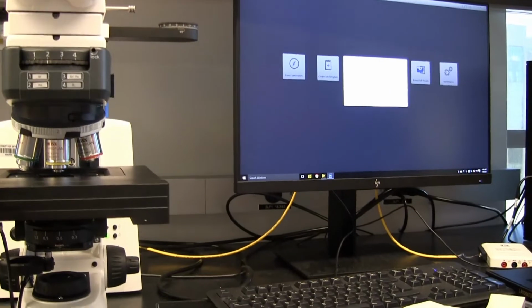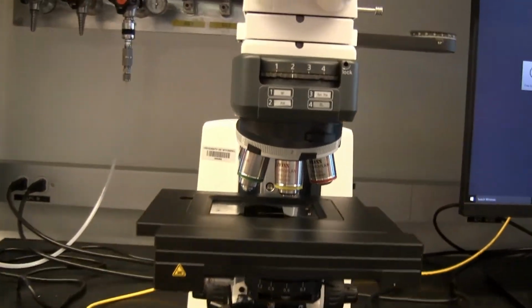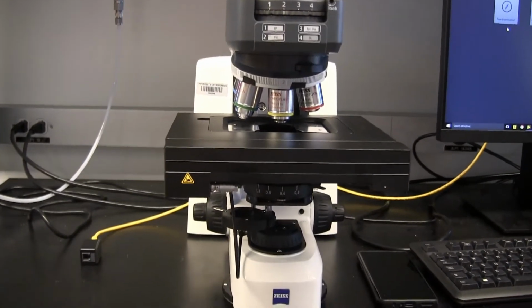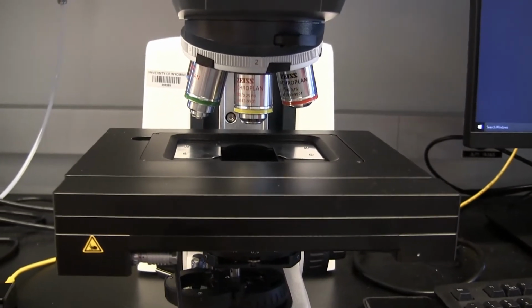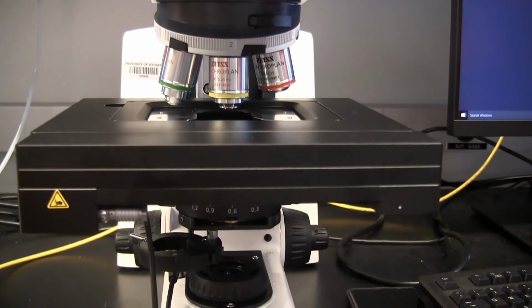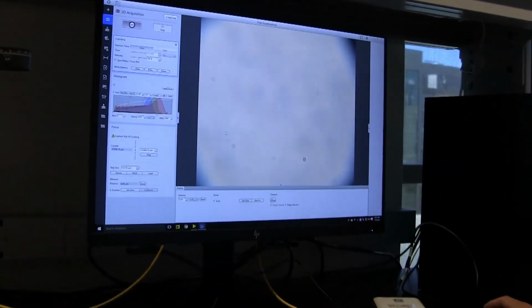It will ask you, okay, calibrate now, and it will try to calibrate the stage movement in all directions, Z direction and X and Y. If everything is fine, it should be fine. If it gives you a beeping sound or anything, then you just try to stop the calibration, reboot your system, try again, and hopefully this time it will work. But try not to move anything with your hand. So now the calibration is finished, and you have your camera working.